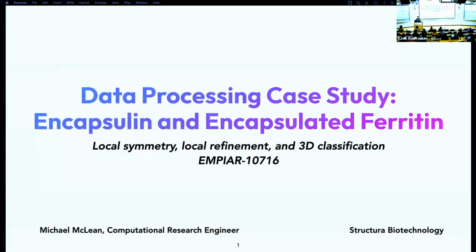And so our case studies today won't actually cover helical processing, but feel free to approach me later today or tomorrow if you have any questions about helical processing in CryoSPARC. Okay, so if you couldn't tell, the theme for today is definitely that of symmetry. And tomorrow we'll really dive into heterogeneity, and Rich will take over again.